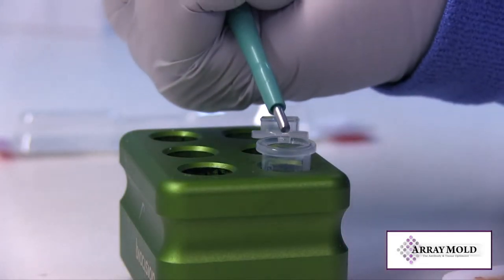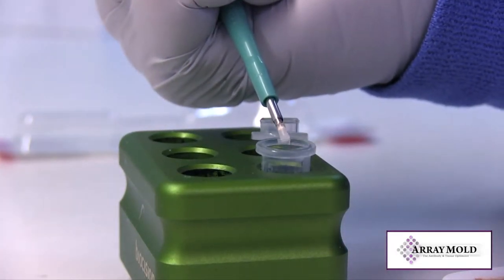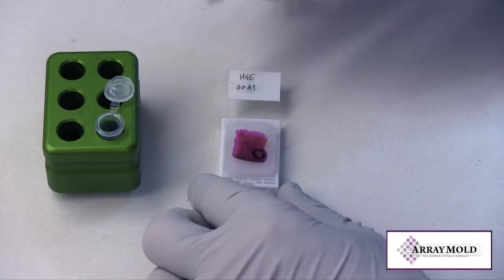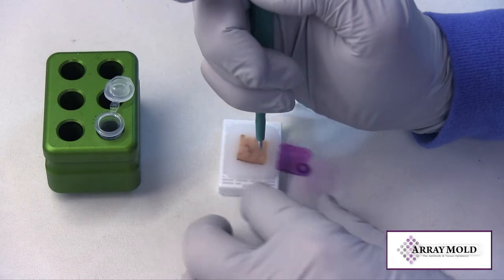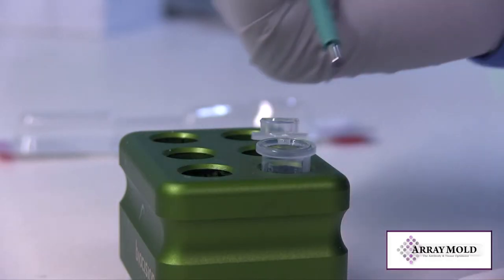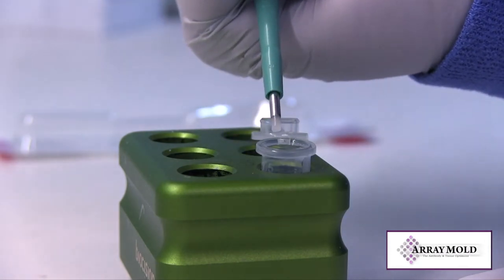Try not to dip your needle into the tube. Remember, the goal here is to stay as clean as possible. We don't want to contaminate the tube when adding tissue cores. Some protocols require all samples to be in one tube, and some require separate tubes for each core, so label accordingly.